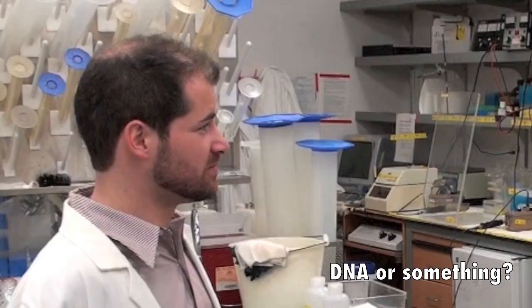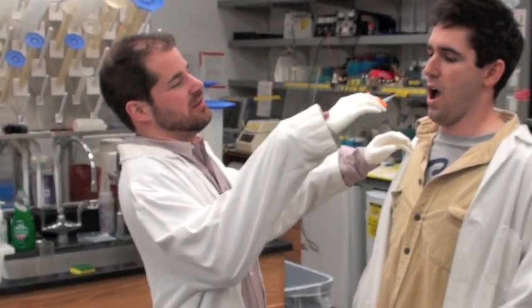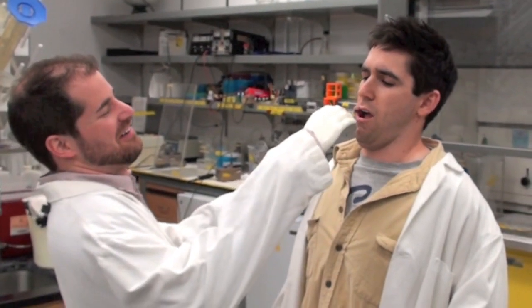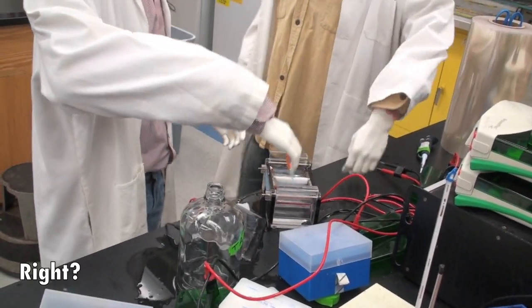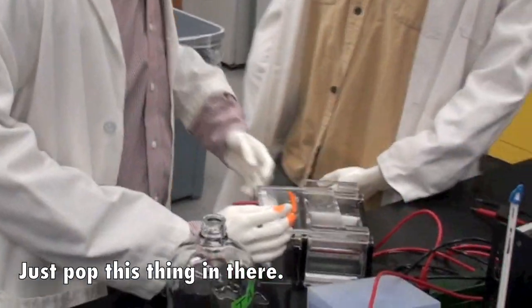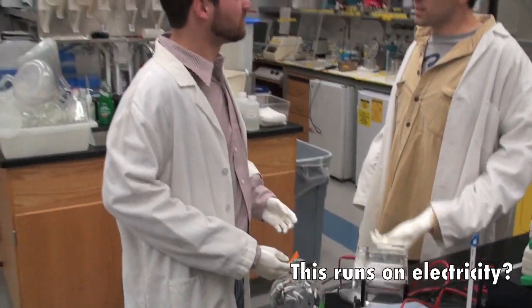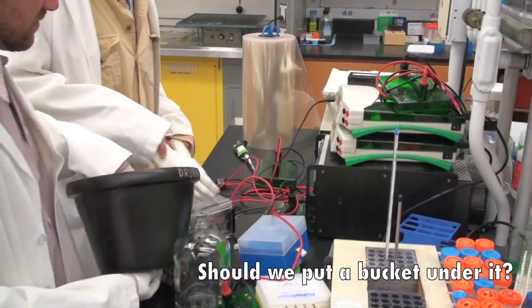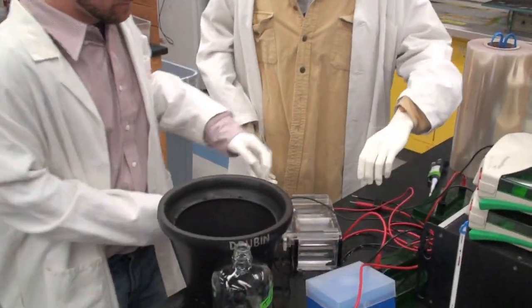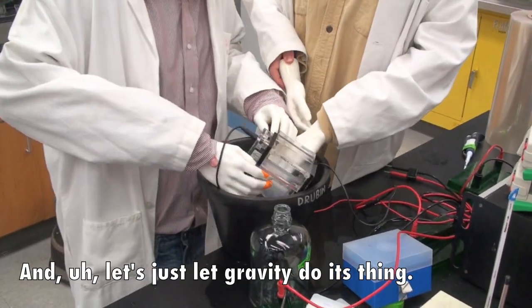Cool. All right. Don't we need a DNA or something? Yeah, we can look at your DNA. Okay. Sure. All right. Like, open your mouth. Get the inside of your mouth. Here. Just dip that right into the gel. A little bit of it everywhere, right? Just pop this thing in there. All right, don't worry about the other end, you know. Electricity, schmectricity. This runs on electricity? Oh, it does. Gravity or something. We could do that version. Here. Should we put a bucket under? Okay. Yeah. So pick it up. Lift it up. And let's just let gravity do its thing.